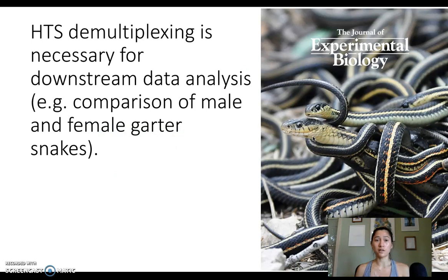The demultiplexing step is so important for our downstream high-throughput sequencing analysis because what you're generally doing in high-throughput sequencing analysis is comparing two or more different sample groups or treatment groups. The data set we're working with this week is comparing male and female garter snakes.